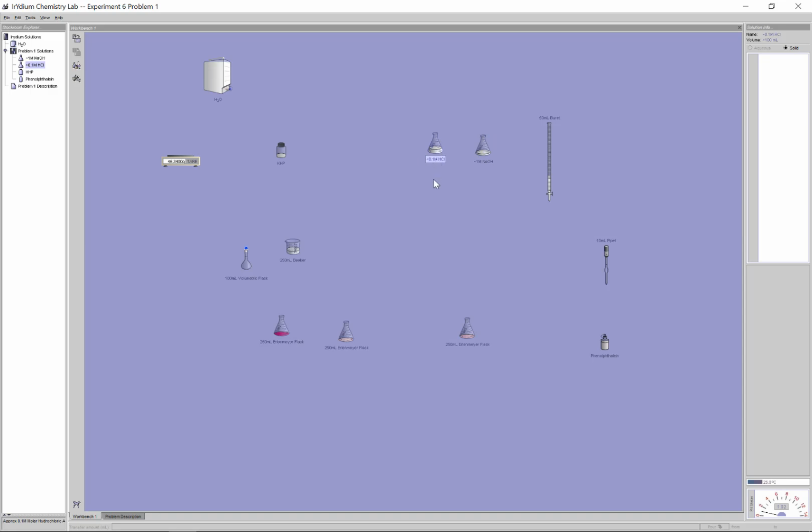So what I'm going to do is also demonstrate for you one added step here, which is involving a dilution. For dilution here, I'm going to take a graduated cylinder out. Let's make it a 50 ml graduated cylinder here. Doesn't really matter. Again, I'll show you the calculation for this later on. I'm going to take this base here that I now know the concentration. I'm going to pour this into the graduated cylinder.